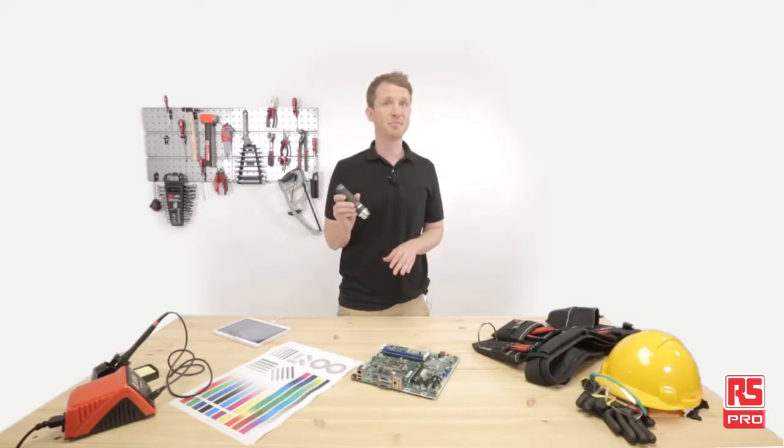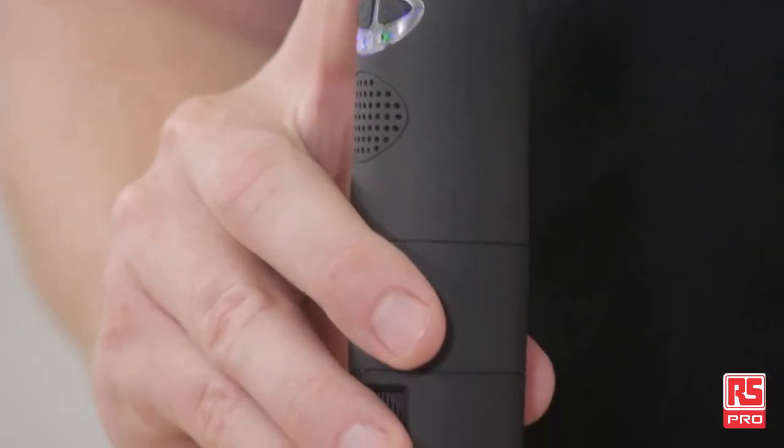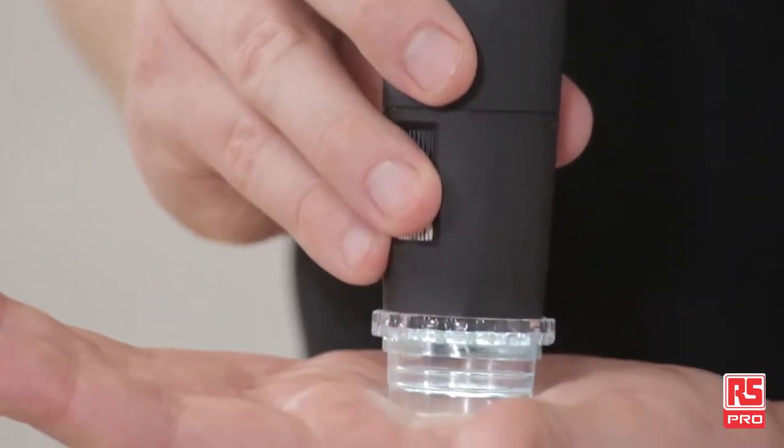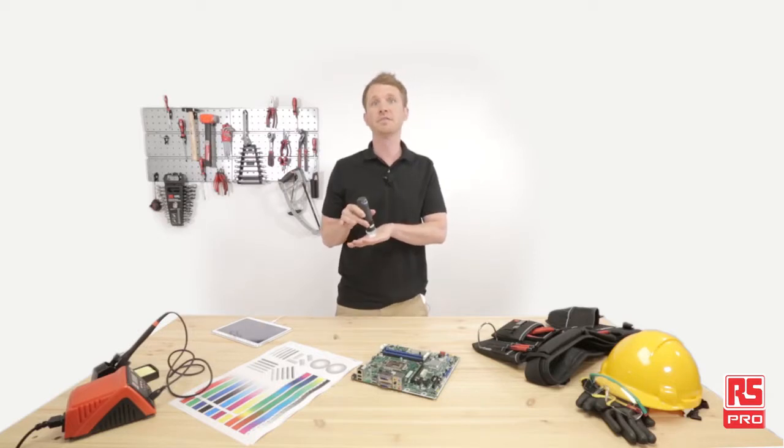My first test will be on my hand, showing some medical analysis. Of course, I'm not pretending to be a medical doctor, but I just wanted to show you how quick and easy it could be — for example, for a dermatologist to do some skin inspections.